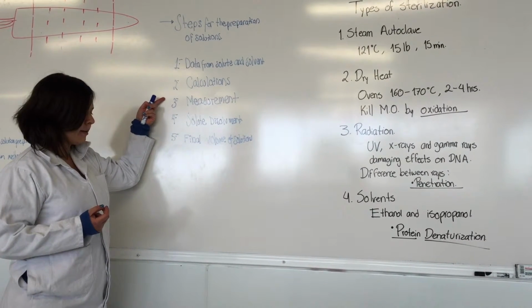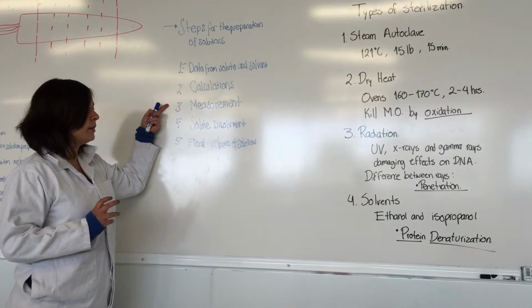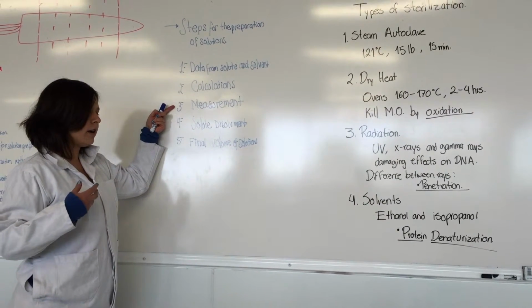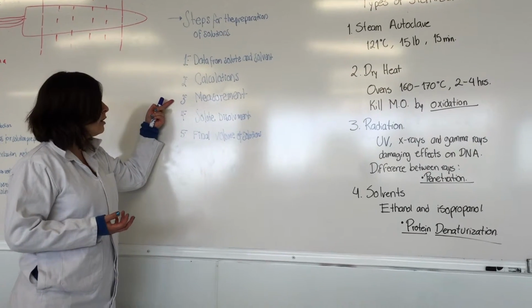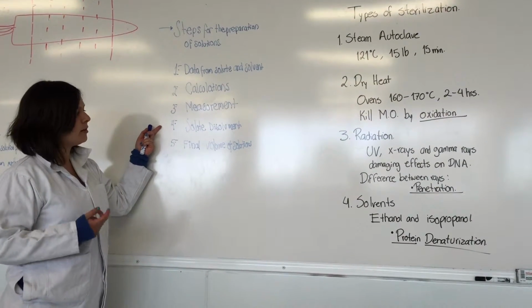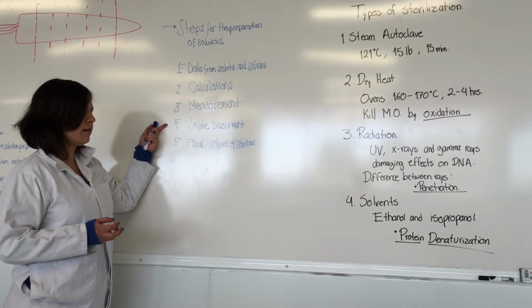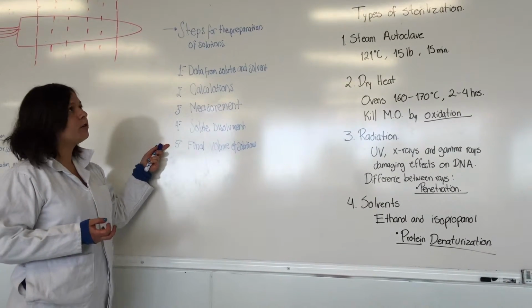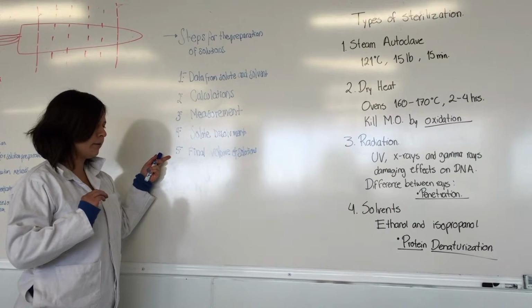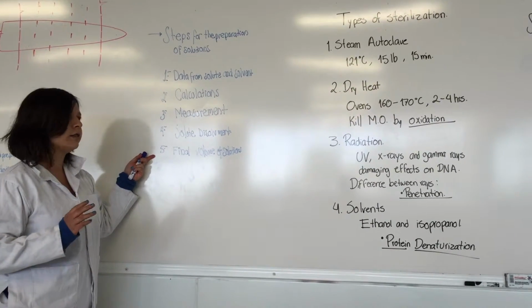In the measurement of the quantities, we will need to put it in a container that is of a higher capacity than the desired solution. Next, we need to dissolve the solute in the case that it is a solid, and then we need to go to the final volume of the solution.